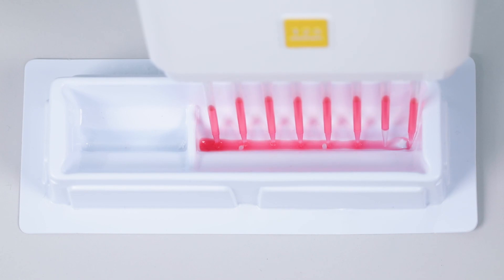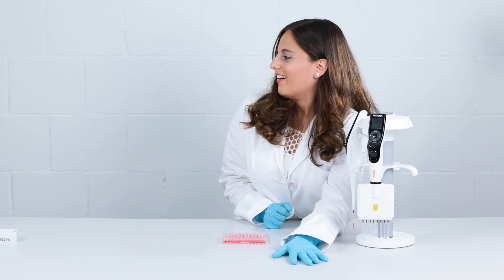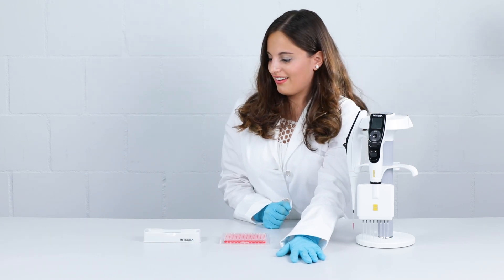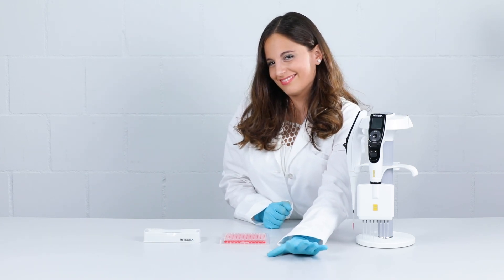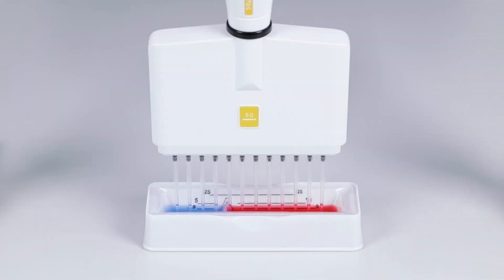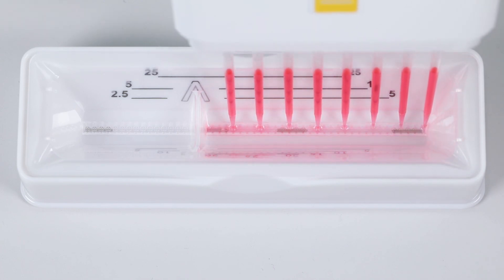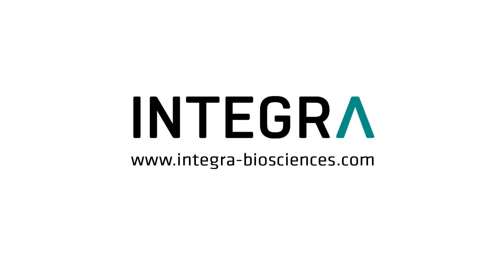The new 25 ml divided reagent reservoir from Integra has arrived. Compatible with all Integra pipettes, it offers the lowest multi-channel reservoir dead volume on the market. For more information, visit our website.